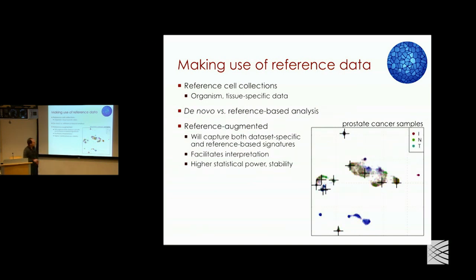In fact, I mentioned there are 3 fractions here, and 2 of them have mostly hematopoietic cells, and this one has mostly tumor cells and stroma and so on. Actually it should be in blue, so these are the blue clusters. So basically, the advantage is, if you do a purely reference-based analysis, then these clusters would either get lumped or get positioned very close to some of the hematopoietic clusters, although they're clearly distinct.